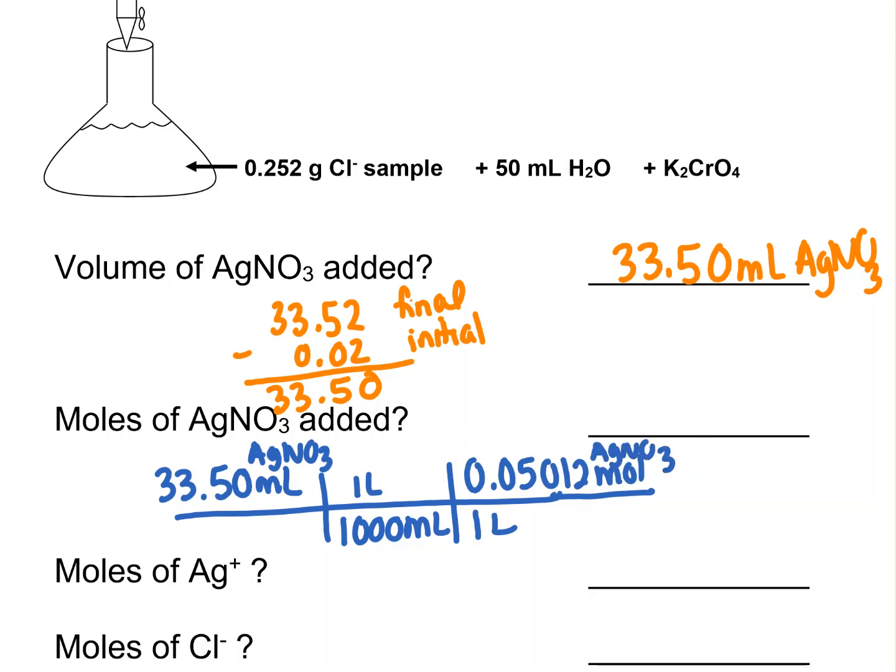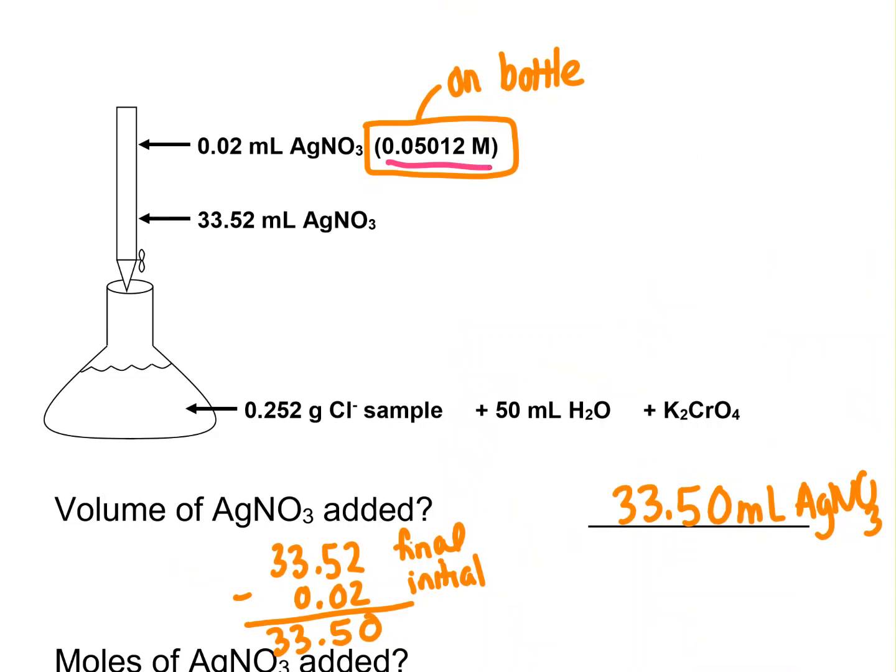And this last number is from the molarity that was given on your bottle, this number here.